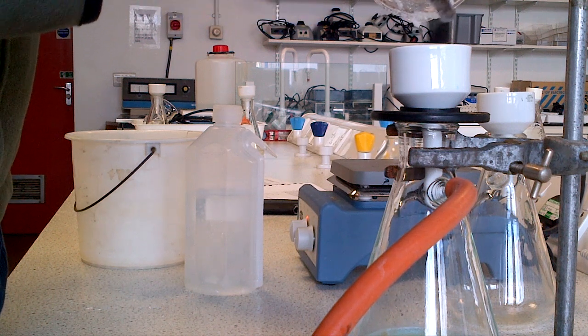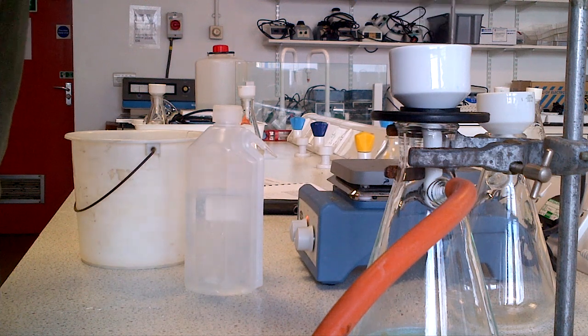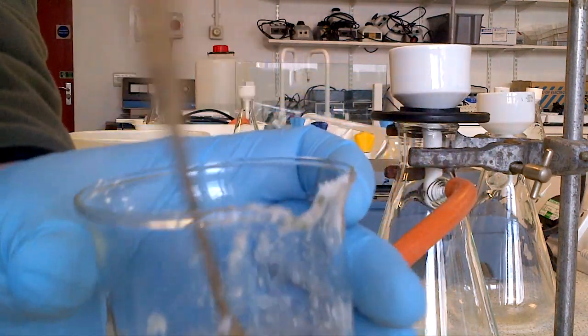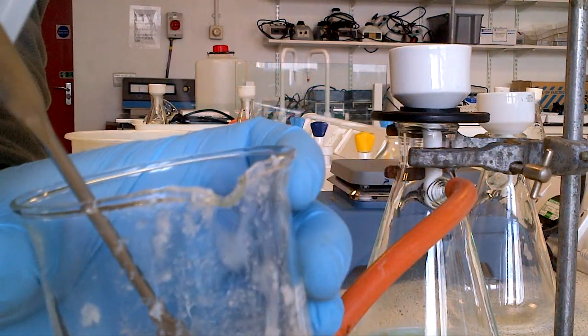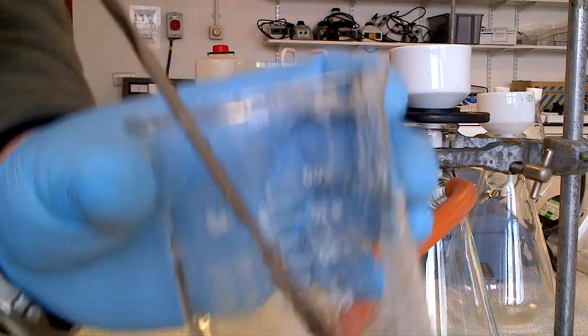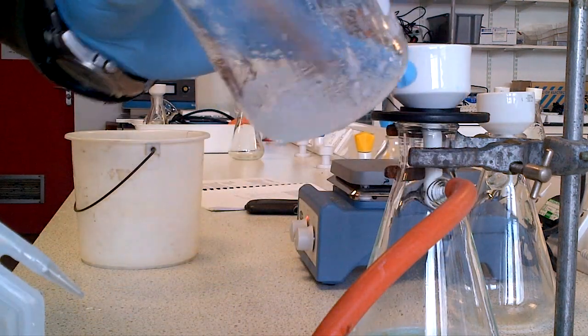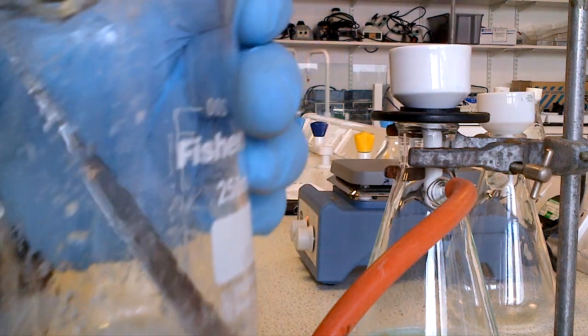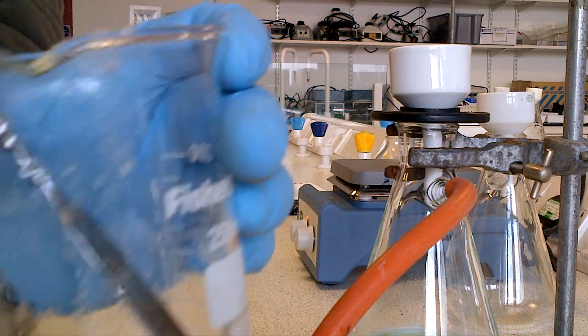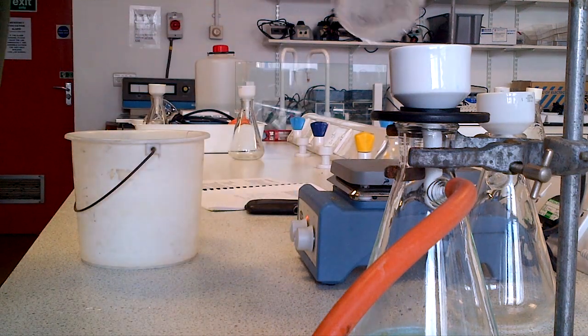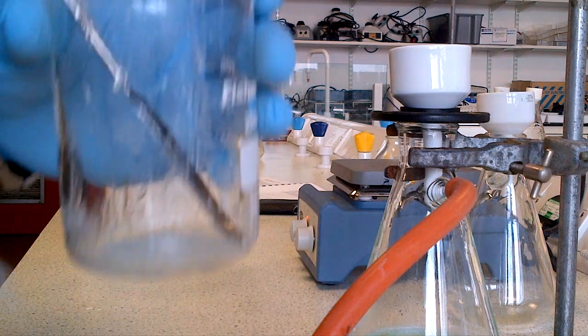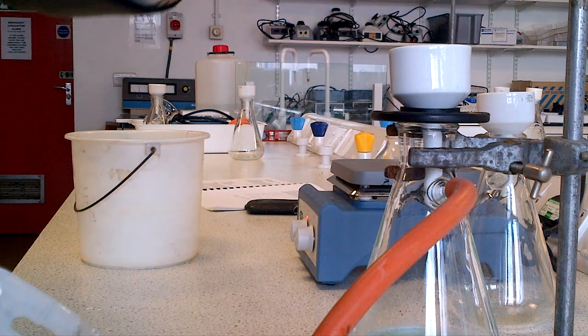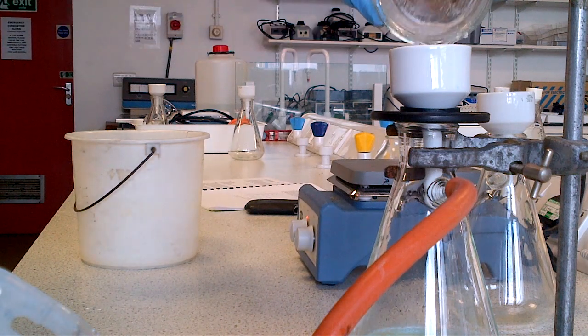Once we've done that, we now start to wash with cool solvent. I try to wash the beaker with quantities of cool solvent, maybe one mil to two mil at a time, to transfer as much of the salicylic acid over into the Buchner funnel. We wash once, twice, maybe three times.